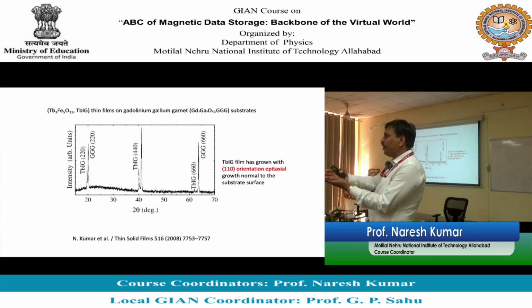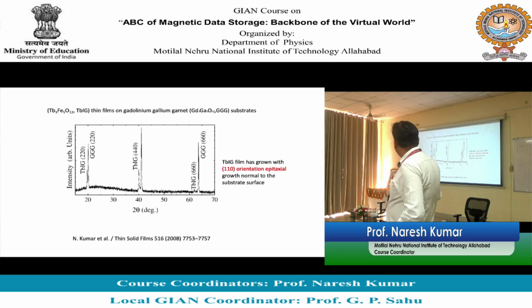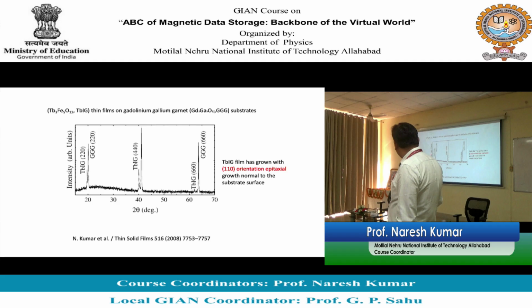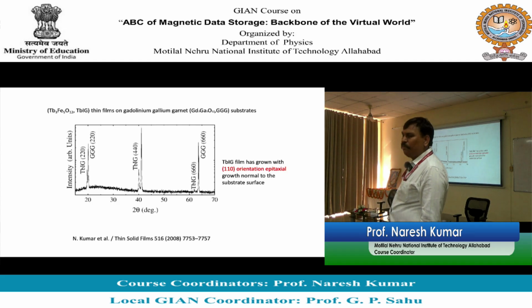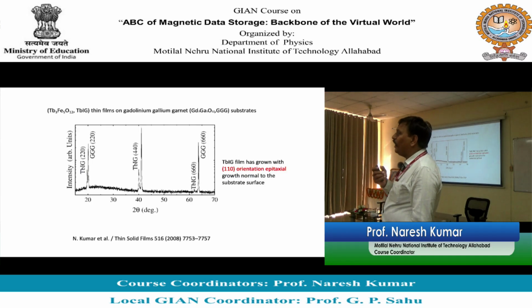I have a substrate of the same crystal structure as that of my film. So if that kind of growth is there, then I won't observe any other peak. Substrate मिलेगा और film मिलेगा. So here I am getting a very sharp peak of substrate, and then there is a corresponding peak of film. Please see, these 2 peaks are very close. If I use ordinary X-ray, then it will be very difficult for me to see this film peak.